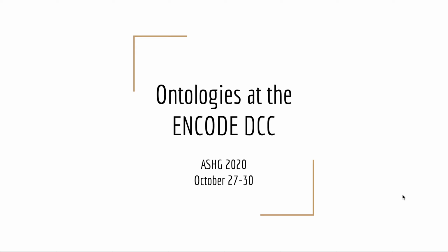Hello, in this video I'll be going over why and how we apply ontologies here at the ENCODE Data Coordination Center.